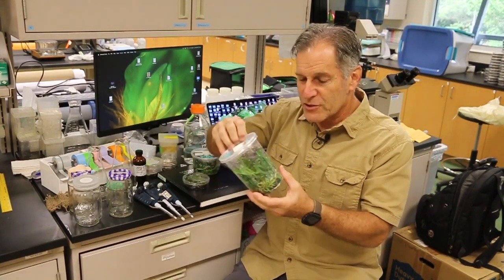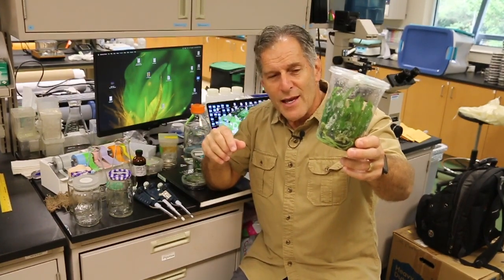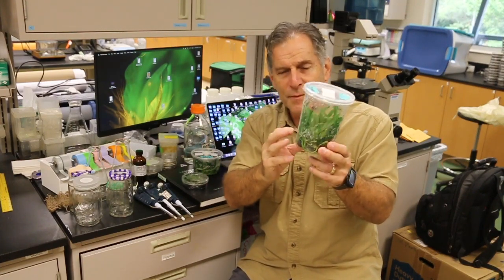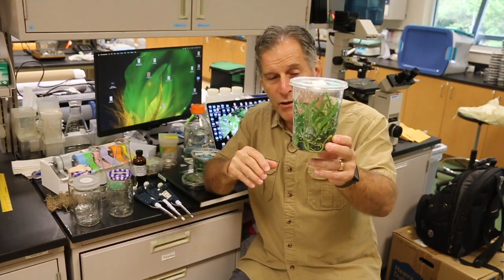But there's some additional things in there too. What I and everyone else are trying to do is tweak to get small increases to have these plants growing big. The advantage of getting big plants in these containers is that this is really a well supported medium, and the plants grow big here.